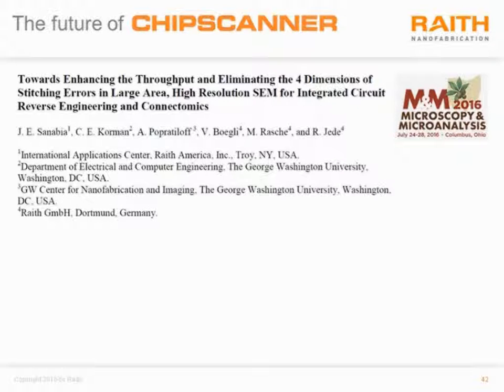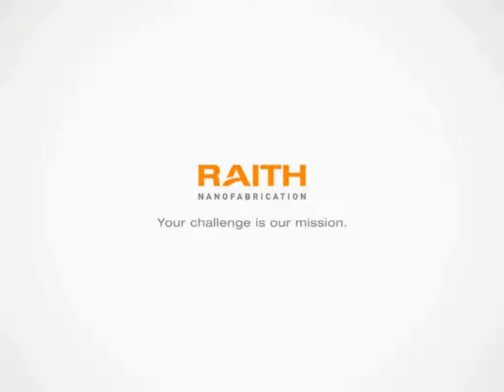And here we will be describing some new technologies that will go towards enhancing the throughput and eliminating, or at least minimizing, the four dimensions of stitching errors. So this concludes my webinar today. Thank you for joining, and we look forward to taking your questions.